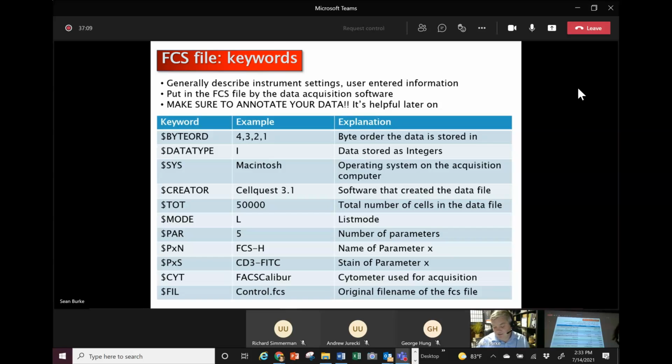And especially with an FCS file or a flow cytometer, because a lot of the time you're not collecting 1 or 2 or 3 data files, you're collecting many hundreds of tubes. And when you come back to that data 3 months from now, because you've been collecting hundreds of tubes for a few months, it's going to be really helpful if you can come back into the data file and see that, all right, Joe collected the data file, Jane analyzed it on this day, we treated it with antibiotic resistant drug 1, 2, 3, and we did this, that, and the other thing.